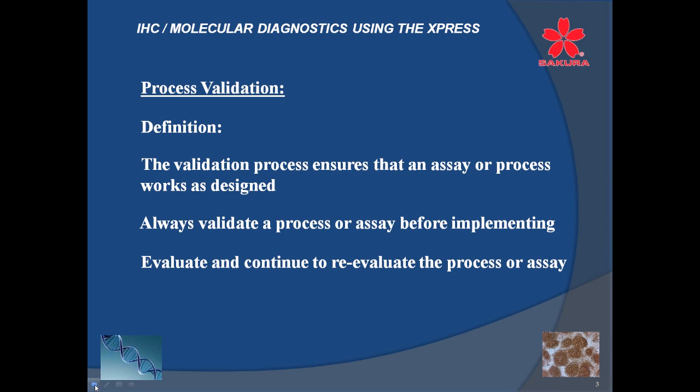In some ways, for some of us, it comes very helpful and very natural, but we're going to gain more access to being precise in our work due to the nature of what we're doing. Always validate a process or an assay before implementing. And I'm just going to use some simple examples along the way. And since we're talking about IHC, I'll do more examples with those than anything else when they're applicable.